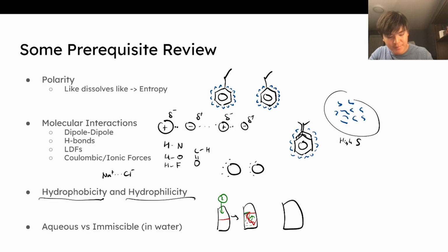So imagine we have A and B. Well, let's say we have A, and then B is just chilling on top, right? They're immiscible because they're not dissolving in each other. So for example, this can be water, and the other thing could be oil. Common example. That's about all the prerequisites we want to talk about, and this should give you a nice foundation of how these techniques work in concept.